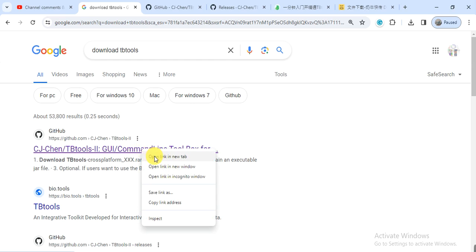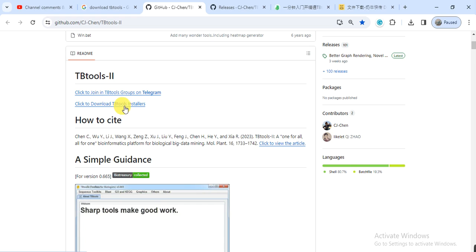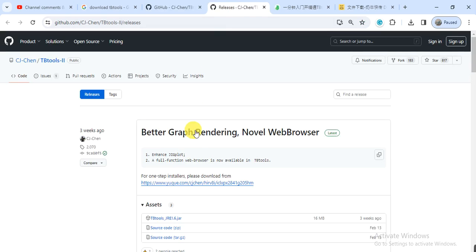Here you can click to download TBtools installer. When you click, it will guide you to this page.